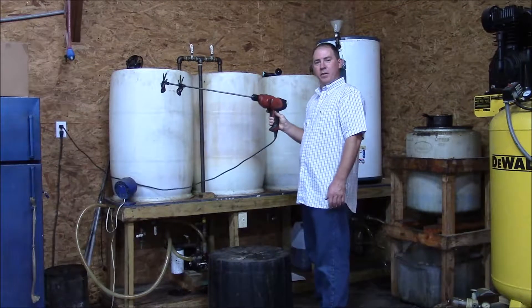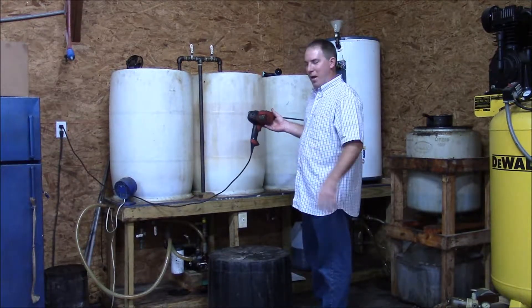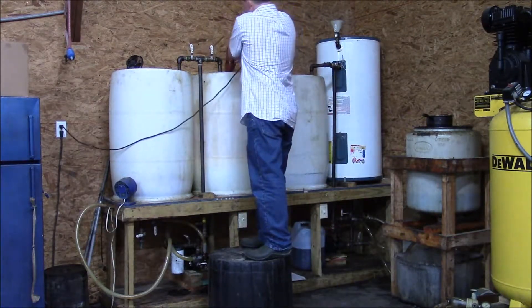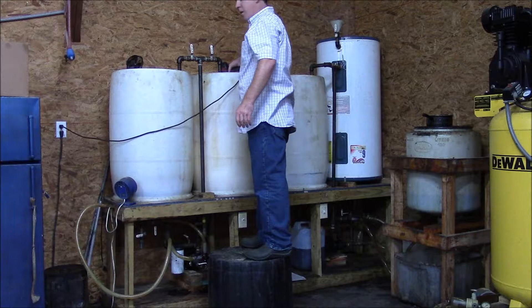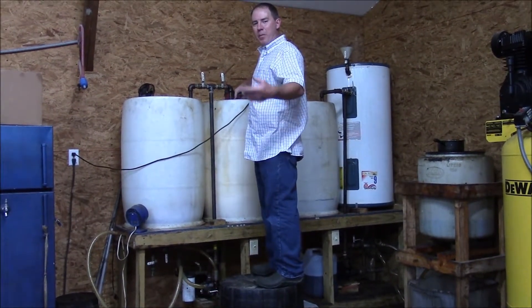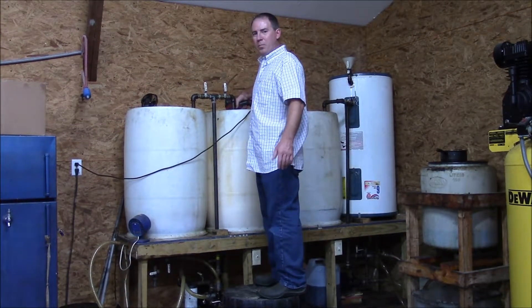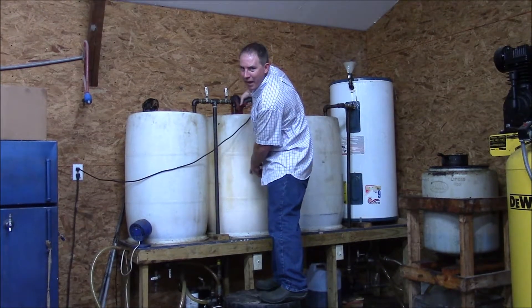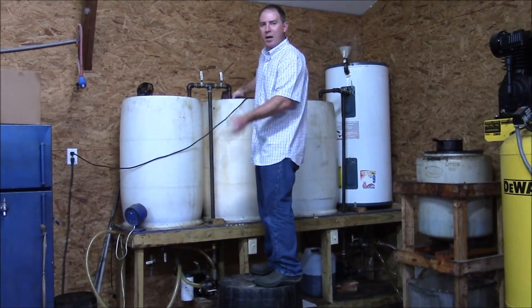What I do instead is use a drill and paint stirrer. I mix it up for about a minute or so. This is going to mix the water from the bottom and the biodiesel really, really well. It'll make something pretty close to an emulsion. You can see the product mixed up quite a bit — it's pretty much homogenous all the way through.